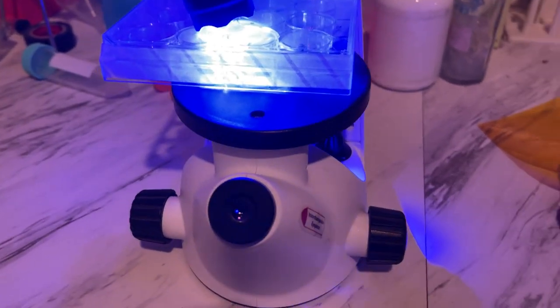The cells here. If I pull the filter off, that's what you get. Just washed out blue. That's why you need the filter. The filter's job is to filter out all that blue, so that you can see the green without the blue just washing everything out.